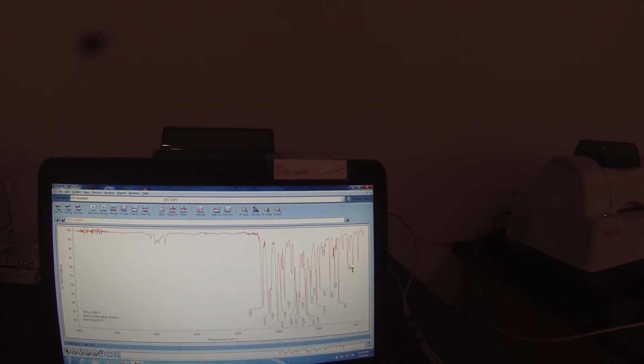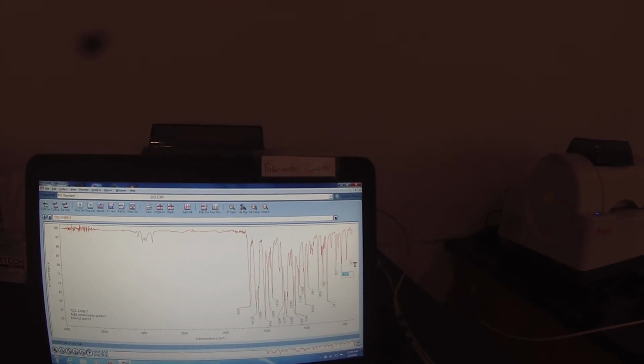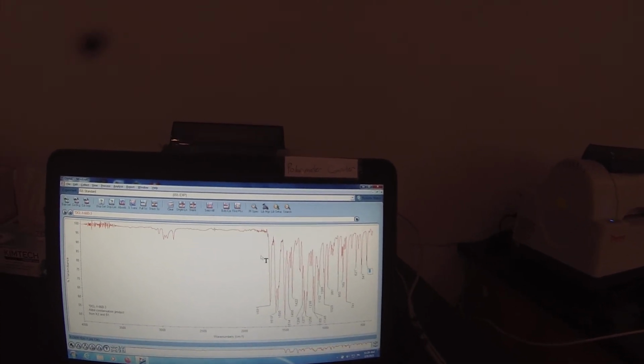So, might as well label these three because they're kind of out of the way. So we can label them without getting in the way of anything else. Oops. And then I definitely want these guys. These peaks are real. And you'll probably recognize that they correspond to sp2 CH stretches above 3000 and sp3 CH stretches below 3000. This 2840 looks like an aldehyde. Obviously it isn't an aldehyde, so there's going to be another reason why that's there.